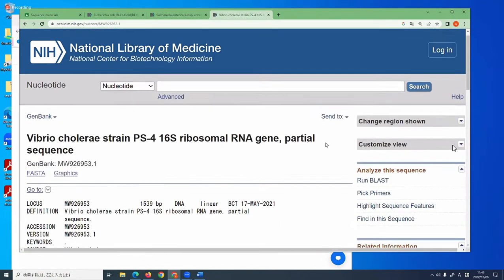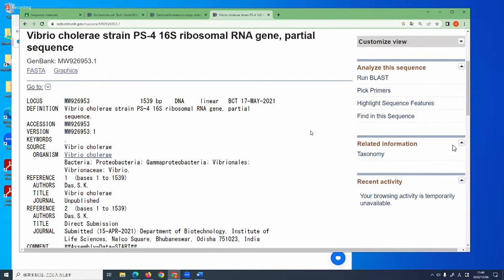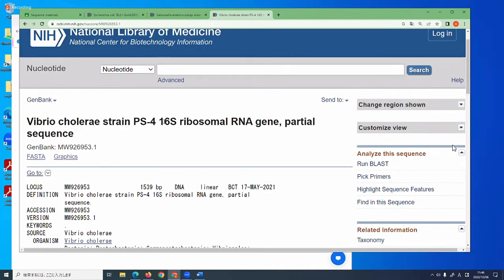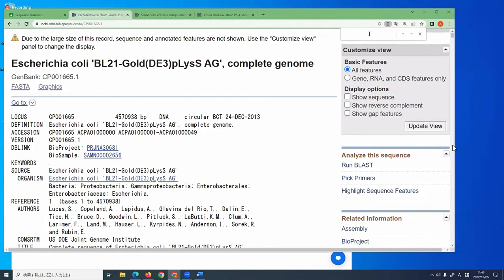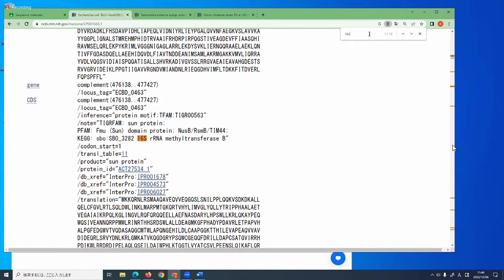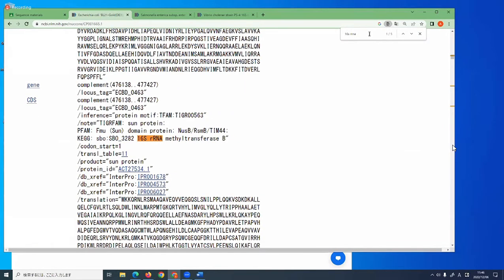And the third one is quite simple because I take directly from the 16S. So we want to look for this gene, which you can just Control F, and we're back at our E. coli page. Let's search for 16S, RR, and A. So not that one, not this one. There will be several genes.